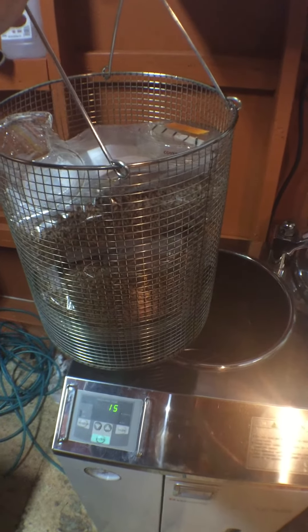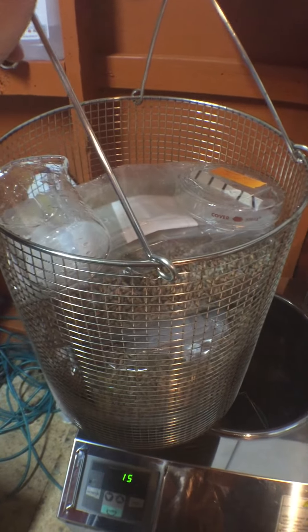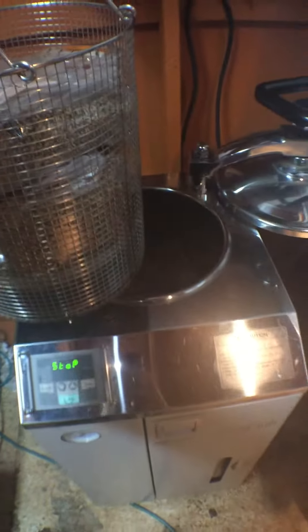Hey everybody, this is Mycolab Solutions. We're about to do another grain run. Here's one of our baskets — it's filled up with about three autoclavable bags, about five pounds each. We could probably fit a little bit more if we fit them in right. We have some stuff on top to keep down the top of the bags.